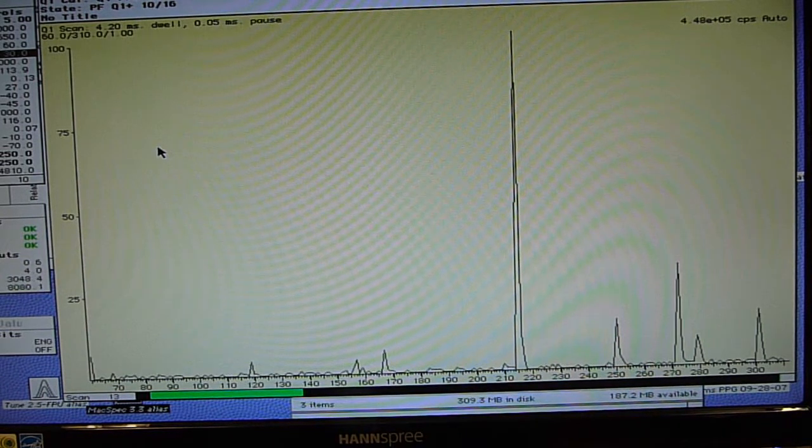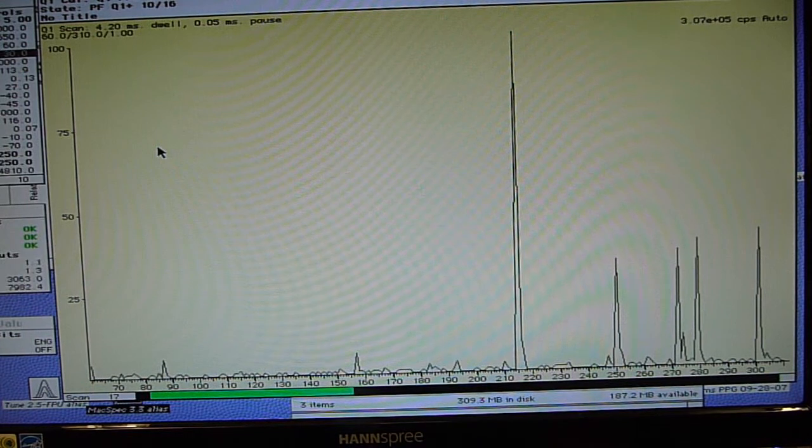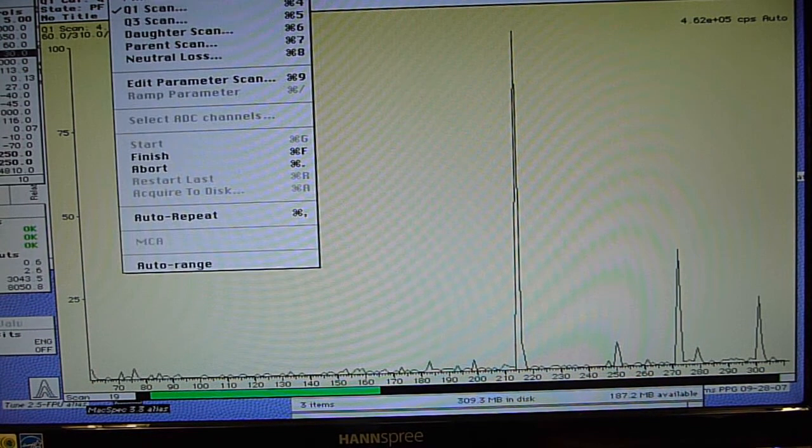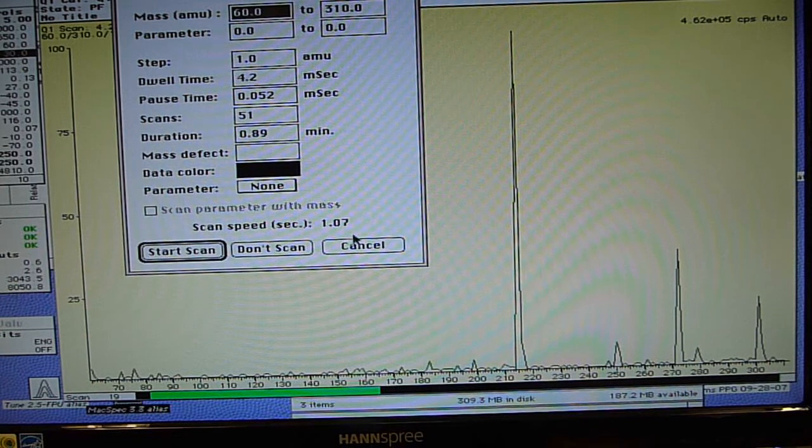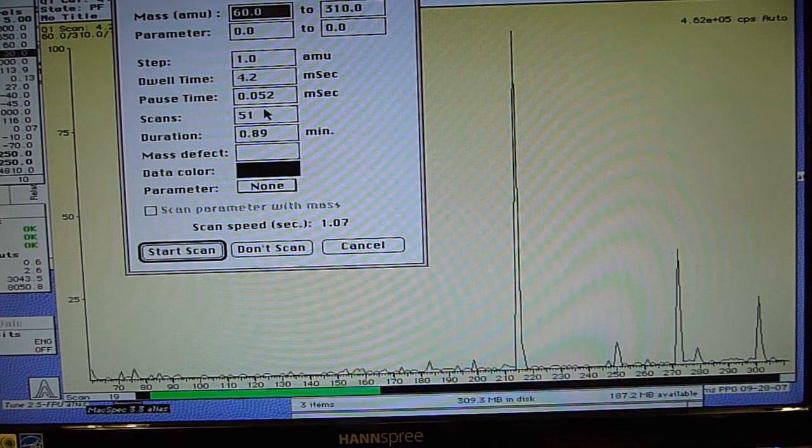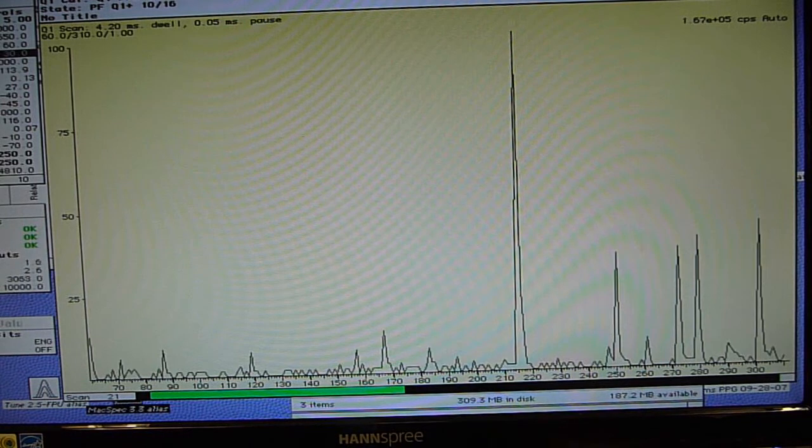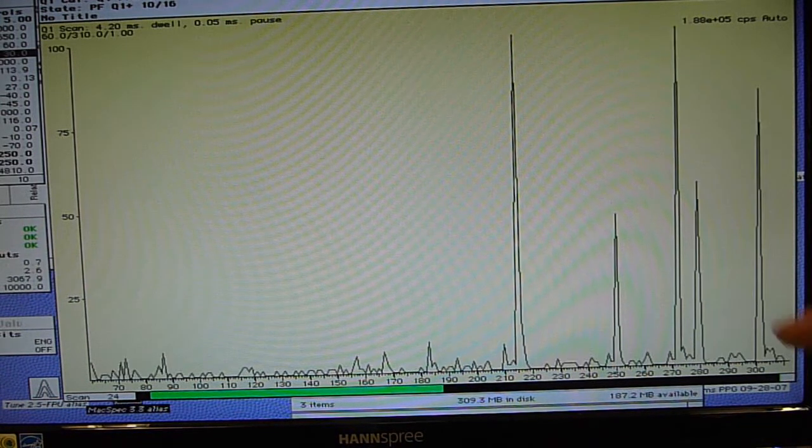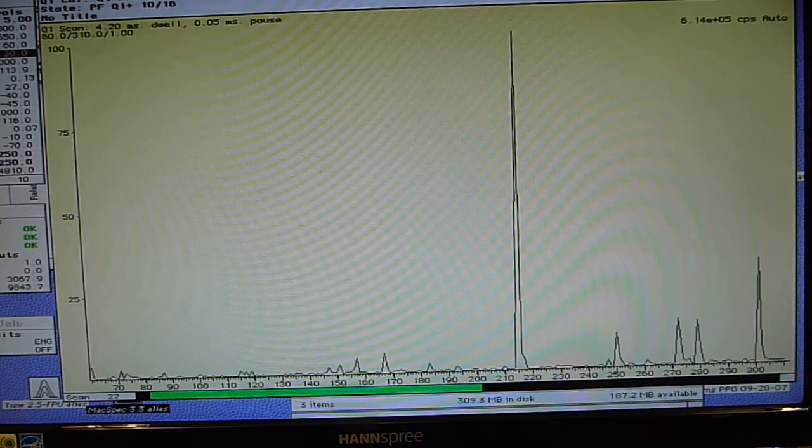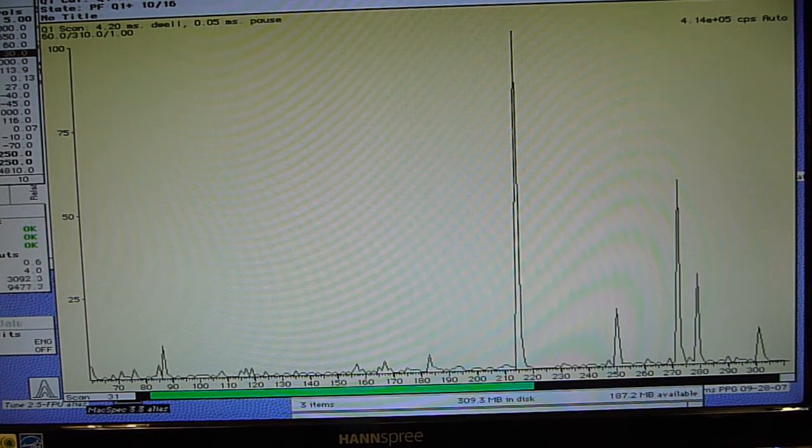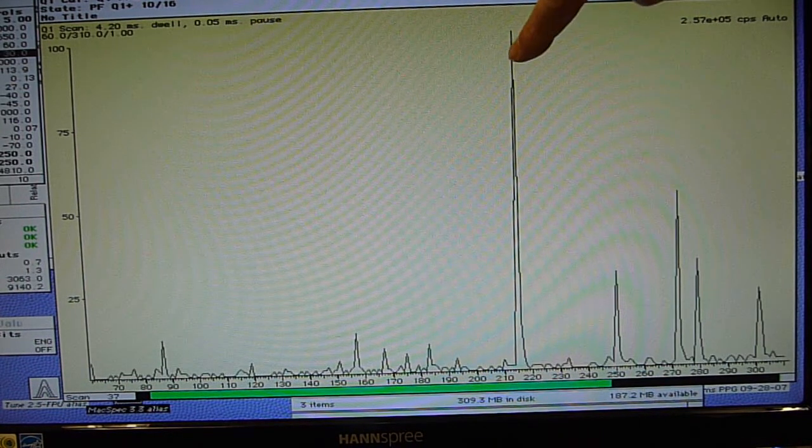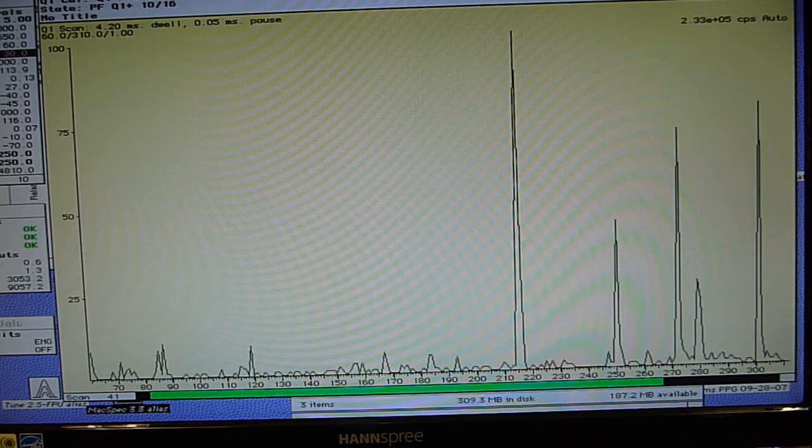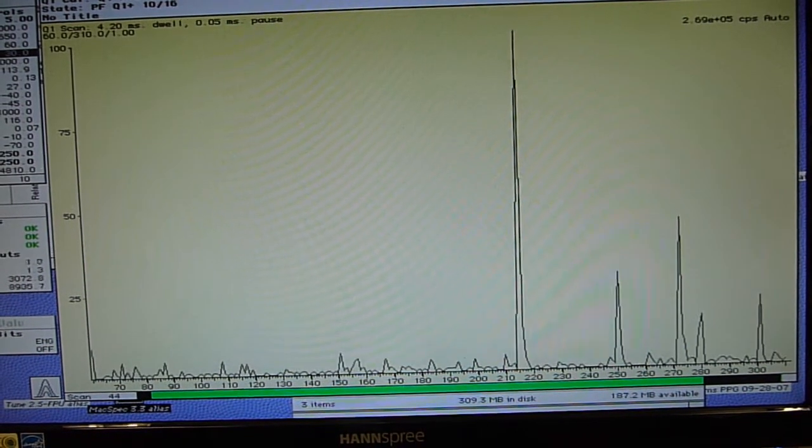With the orifice plate not open, you can see the background's in the low 10 to the minus 7 for vacuum. Since this is cryo-pump, the cryo-temp is a little over 16 Kelvin. Pretty cold. To start things off, this is the scan in real-time. Q1 scan is 60 to 310, 1 amu step. Roughly a little over one scan per second. You can see it's sort of a dynamic situation. You've got some fluctuation. Sometimes ions are more intense, other times they're not. It's just the way it is. So we're going to ask the question, where are the sodium adducts?